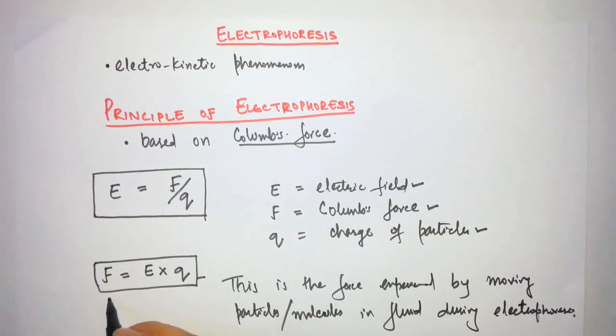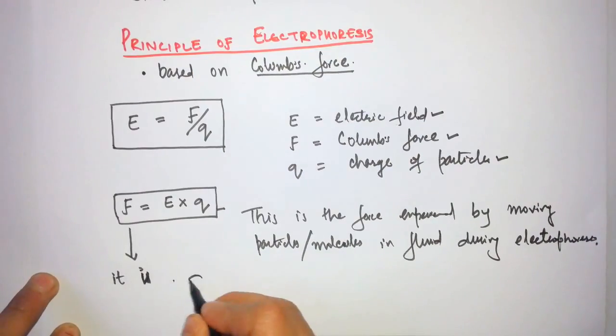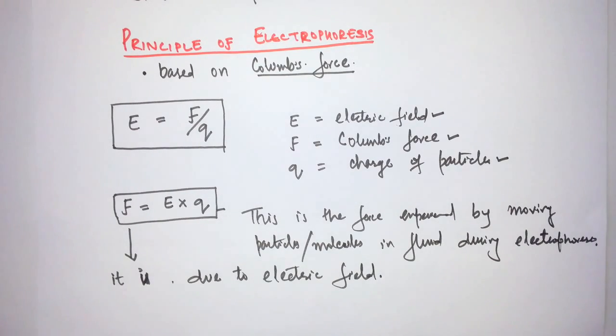Guys, keep this in mind. This is due to the electric field, because there are two forces, and do not overlap these two forces, because they are two different forces that oppose each other in direction.